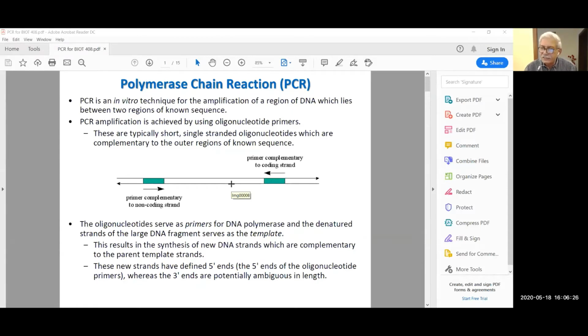Okay, so these are some of the basics that you must consider when you are trying to set up a PCR reaction. Think about your template and then what you are going to amplify and what kind of polymerase is the best one for that. So select the one which is high fidelity if you're working with genes. If you're just working with detection mechanisms or optimization of a PCR reaction, you can go for Taq polymerase.